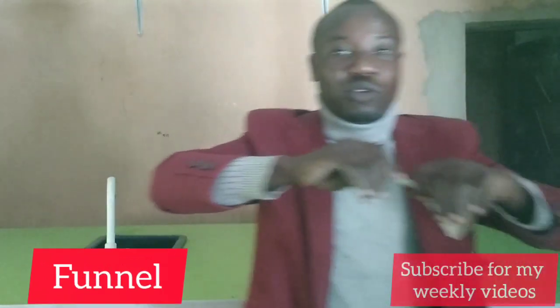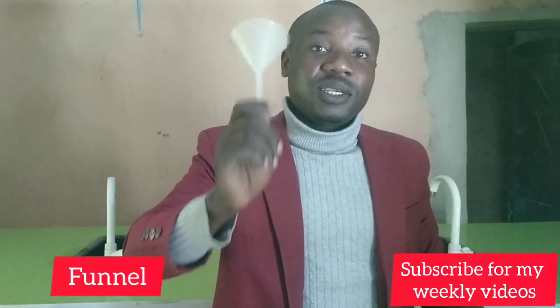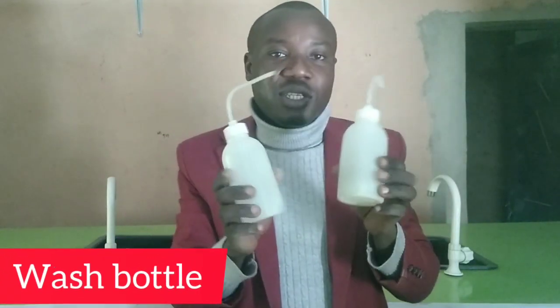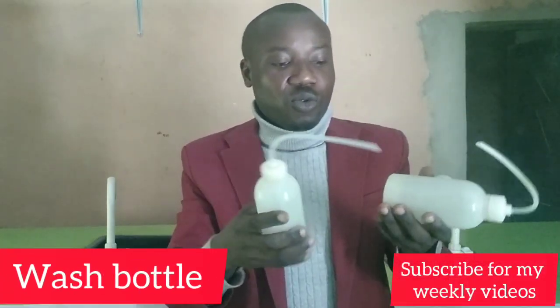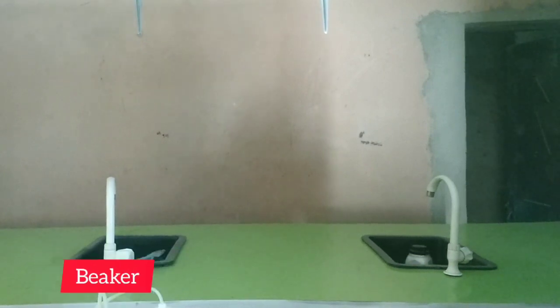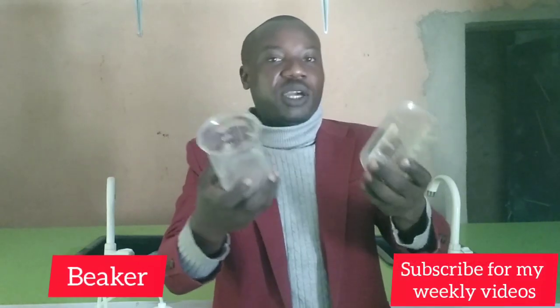This is also our funnel. I told you that we have different type of funnel. Some are made up of plastic, while some are made up of glass. The one I'm holding right now is made up of plastic. This is what we also call wash bottle. This is wash bottle. So we can put water on it, and from there we can press. We use it in washing if we want to wash, and maybe adding water to the solution when the need arises. We also have what we call the beaker. So this is the beaker. You can see them. This is beaker.